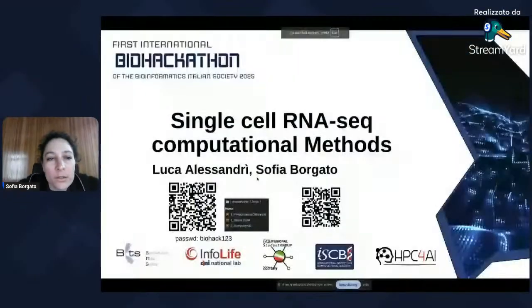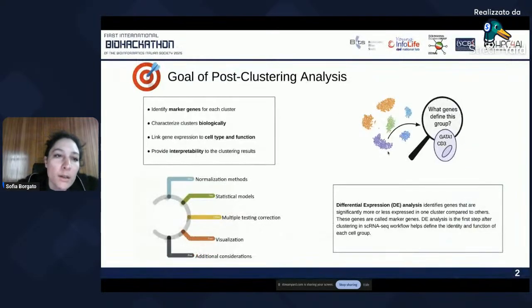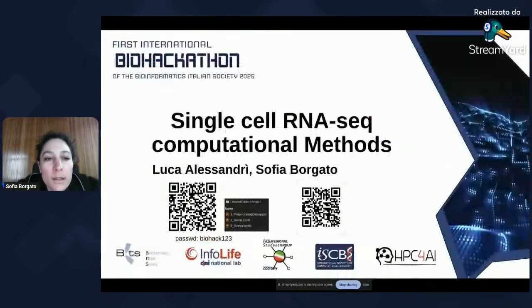Hi, I'm Sofia, and I'm going to talk to you about single-cell RNA-seq computational methods, the second part, which is related to evaluating your clustering algorithm in terms of characterizing clusters biologically. The code that we will see later is available here, in a GitHub repo.